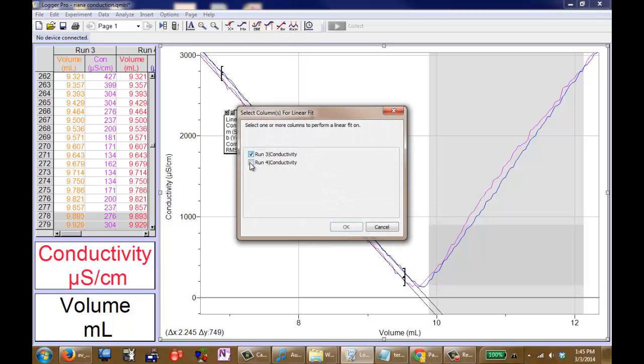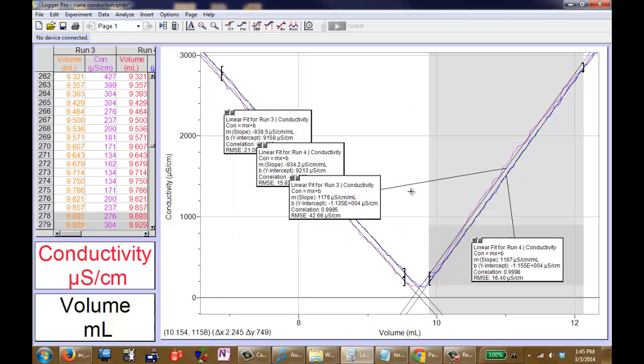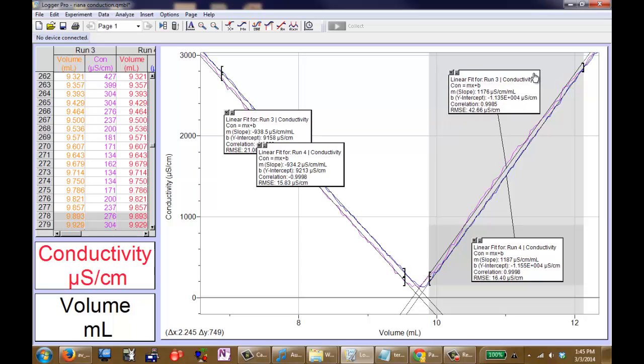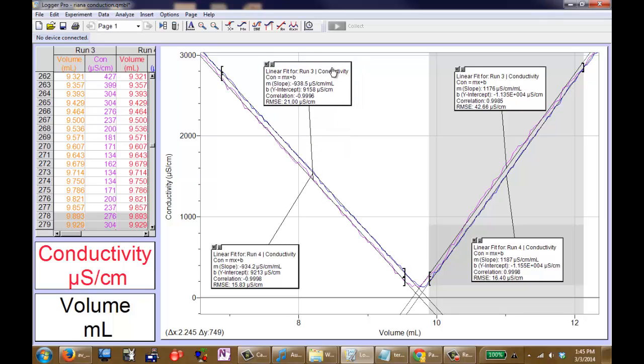We'll do this for both runs so you can see the comparison. The bottom will be run four and run three at the top. We did two other runs that you didn't see in the video that didn't work out that well, so we just use the data we have here.